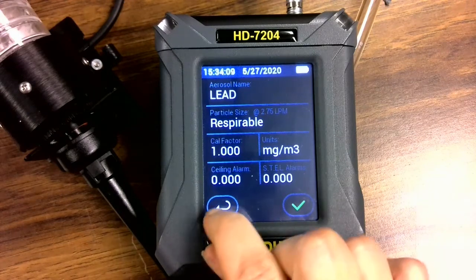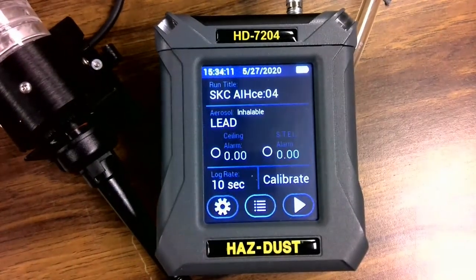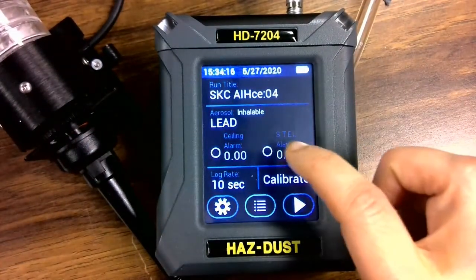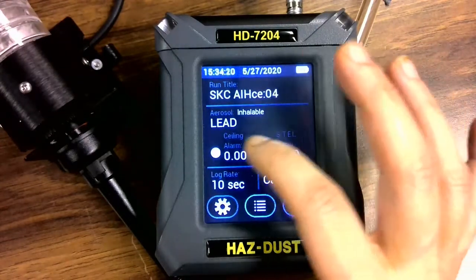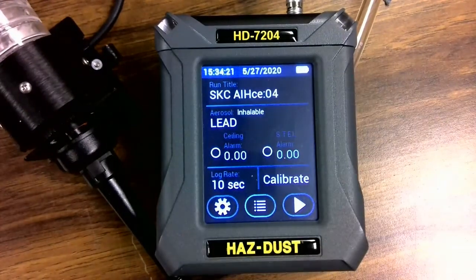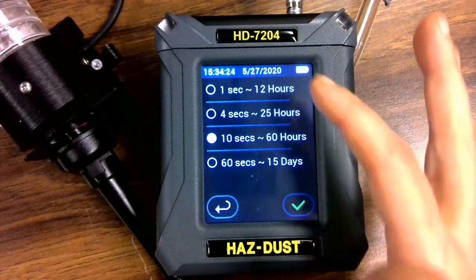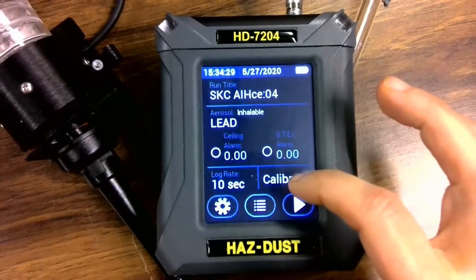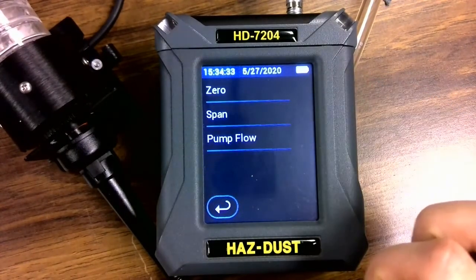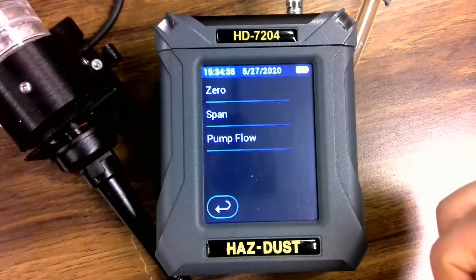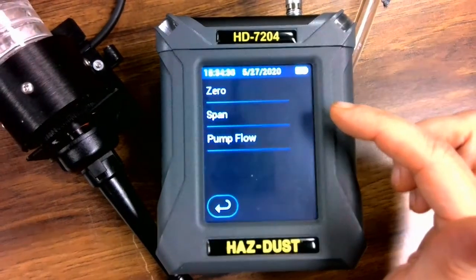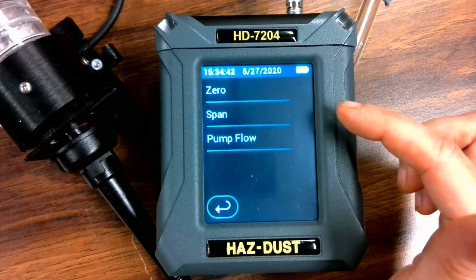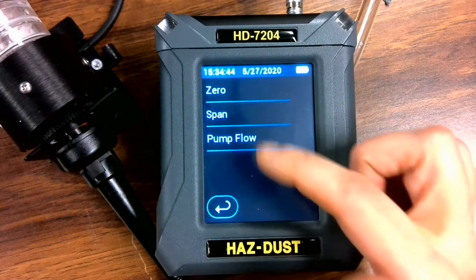Let's go back to the home screen. I can select the ceiling alarm or cell alarm, and by pressing this, I simply turn it on or off. I can also select the log rate here, and it will tell you how long the instrument will run based on your selection. Then we have the calibrate button. By pressing the calibrate button, we can zero the instrument, check the particulate calibration using our in-field calibration span reference accessory, and check the flow.